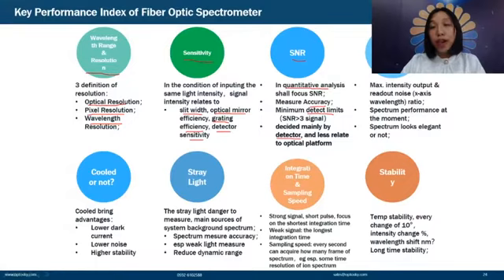And fourth is the dynamic range. Dynamic range uses the maximum intensity output divided by the noise, and is the one-time spectrum's performance. It can show one spectrum against another spectrum's performance, and it also can make the spectrum look more elegant.